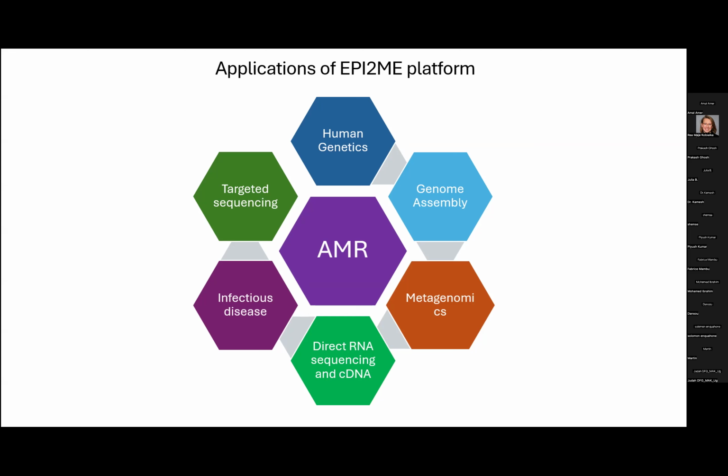That's how we can get more information regarding the antimicrobial resistant genes, and we can monitor easily even in remote settings. Right now we are getting all the information from the high income countries regarding antimicrobial resistance. If we capture more data, then we can design the interventions, and we can go for more surveillance from the low resource settings.